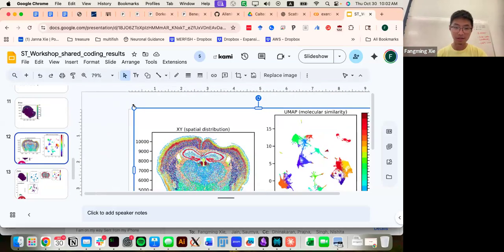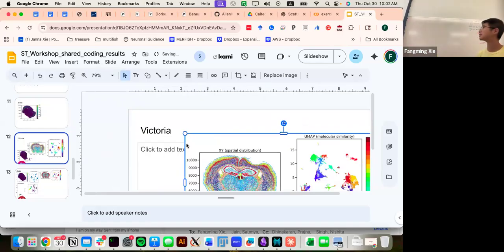Good job, everyone. Let's take a 5-minute break, and we'll be back with our last exercise in class. We've done k-means. We will work on top of k-means, and just compute the cluster centroid pseudo-bulk profile for all of these clusters. Okay, 5-minute break.